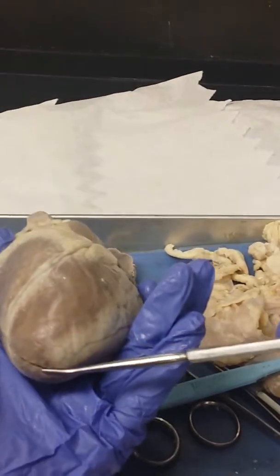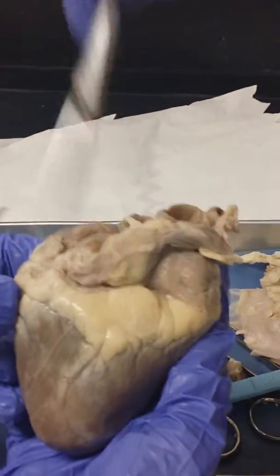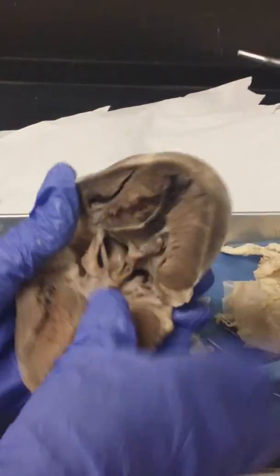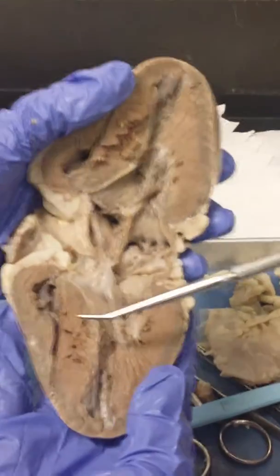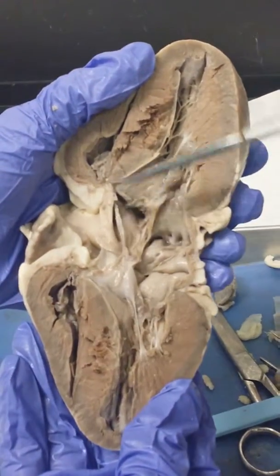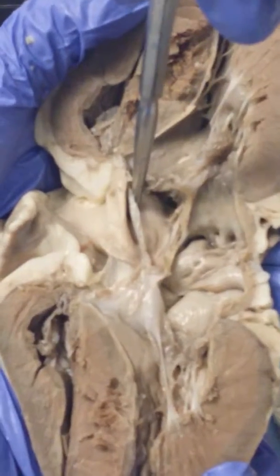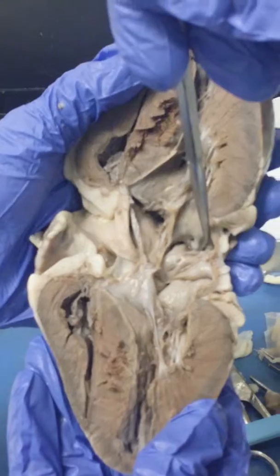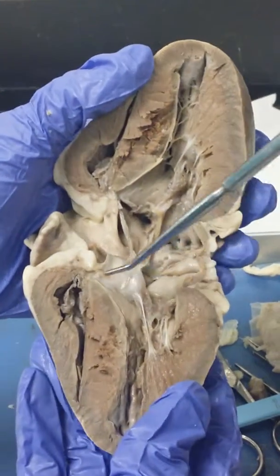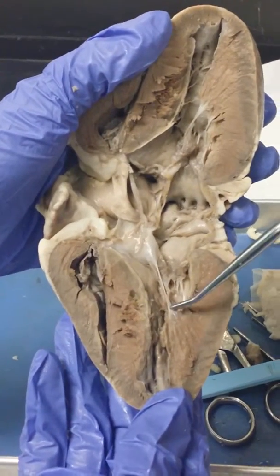This is your apex, and then posteriorly this is your base. If we open it up, this is your right ventricle and left ventricle. This deep area — hard to see — but that would be your right atria, and right next to it is your left atria.